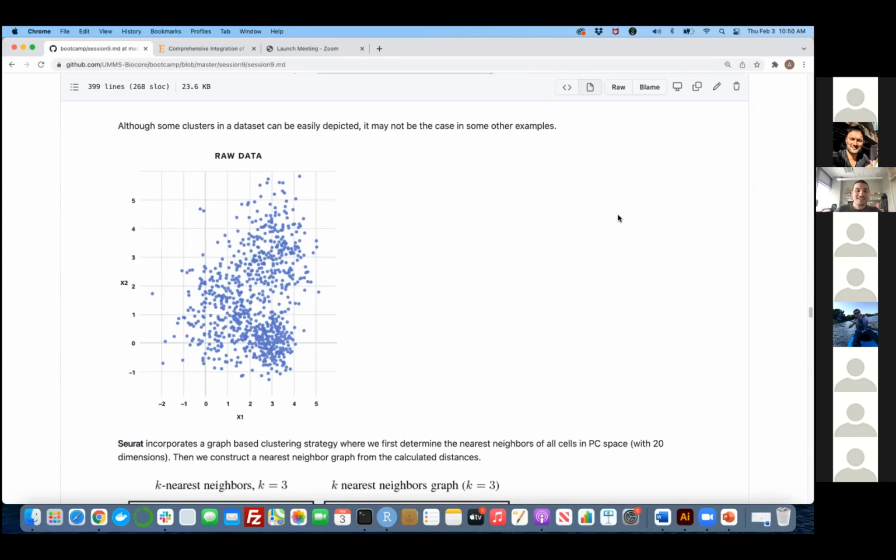Nazgul said 2. It could easily be 2, by the way, because it's really hard to pick up, right? It's not like you're always going to have clustering patterns that are really easy to pick up. But if you really want to pick some number of clusters, you would probably pick this as a cluster. And obviously, these cells are closer to each other than all other cells, right? So this is what we are trying to do with data clustering: understand the optimum number of clusters, not the actual number, where you can easily pick the differences among them.